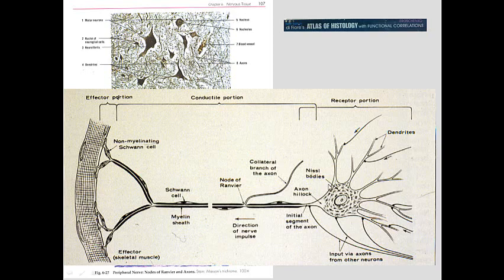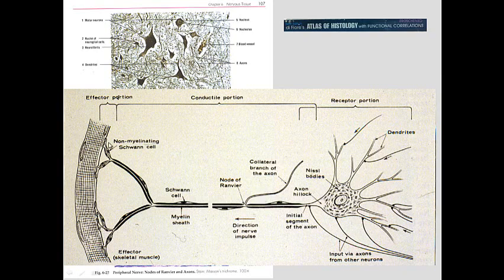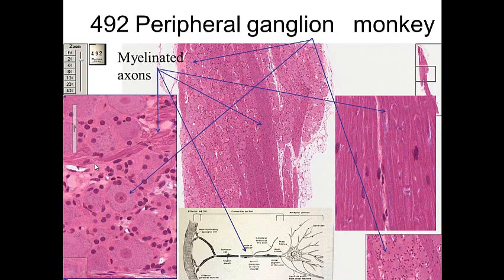Here we can see the cell body, and the granularity in the inner cell is the Nissl substance. Dendrites are for receiving messages, and then the axon coming through here — you can see the myelin sheath — this is a Schwann cell. One there, one there, one there, and where they connect is a node of Ranvier right here. They are myelinated all the way to the very end to stimulate this particular muscle cell. Cell body, axon, and then you've got the terminals at the very end.